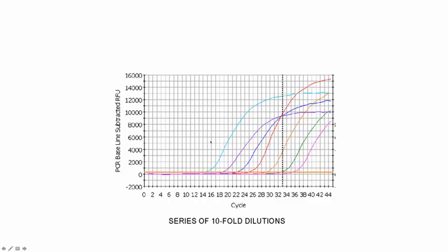So in an effort to maybe be able to more adequately explain how things are moving, and also not wanting to wait till the very end of the reaction, because remember, the reaction takes time, and then you have to load it in a gel and wait for the gel to run and wait for the gel to stain and things like that.